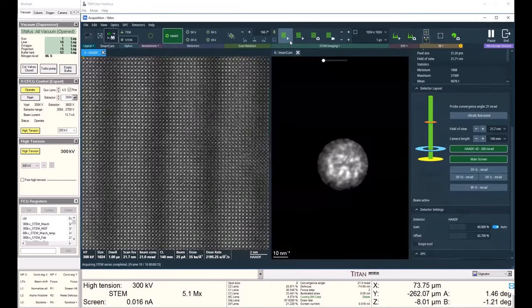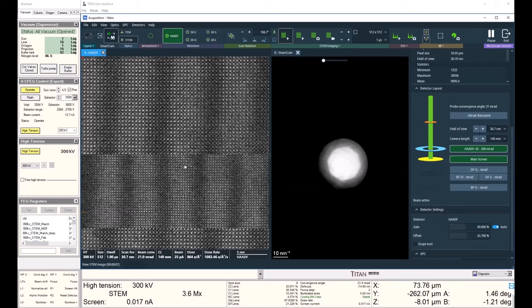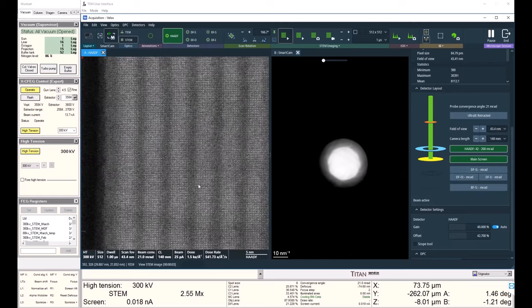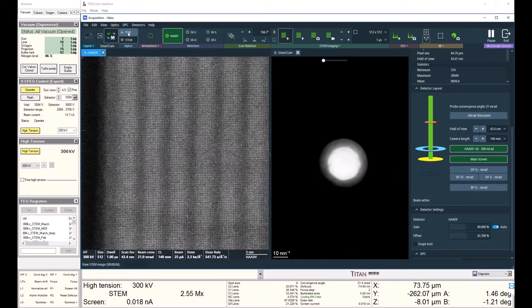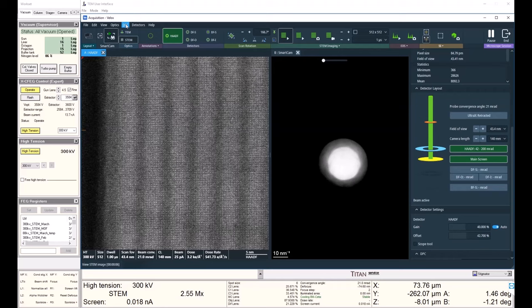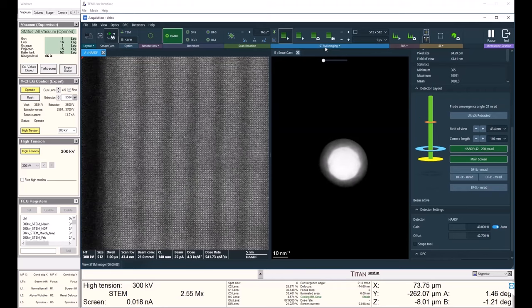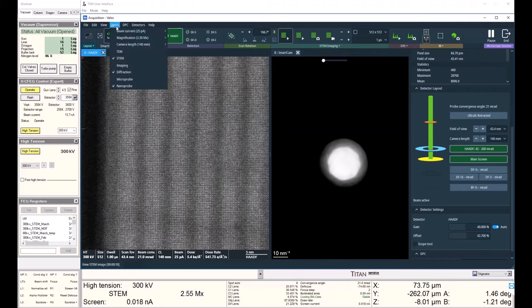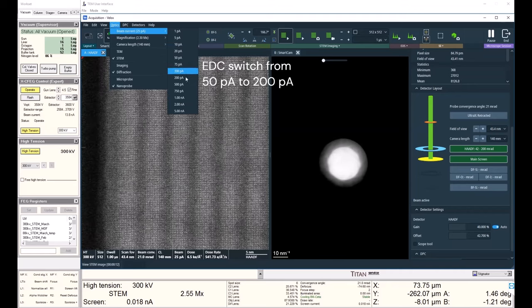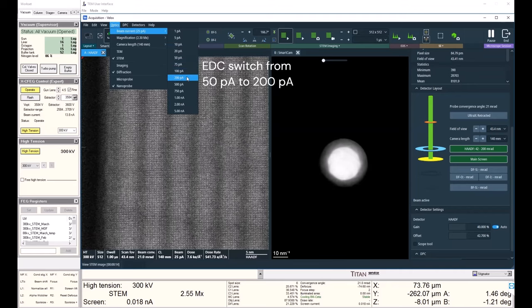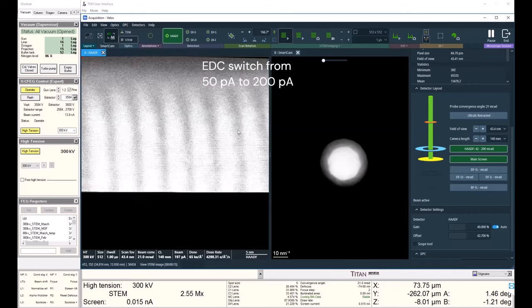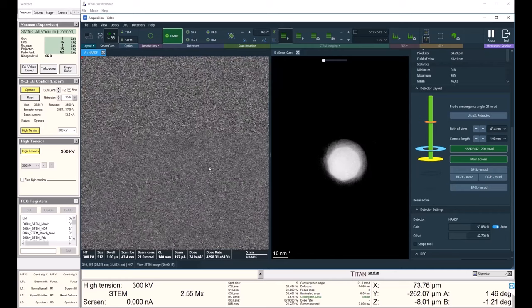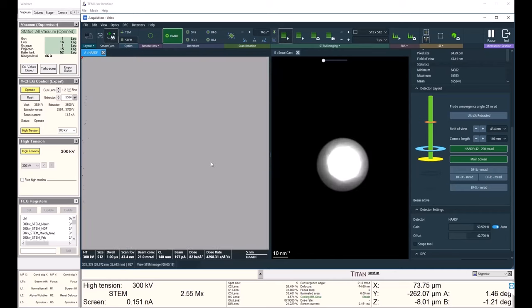Now I've taken the images I want at lower dose, and now I want to switch to an EDS condition. So I can also change my dose. I can change it from the imaging tab, or I can go into optics and just change my beam current. Let's say we want to do 200 picoamps to do EDS. I can see my beam is 200 picoamps now. My dose and dose rate have gone up accordingly.